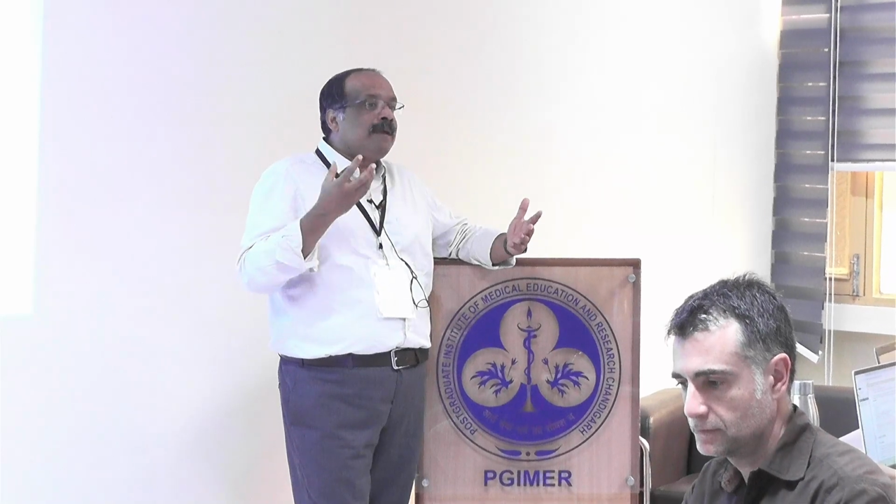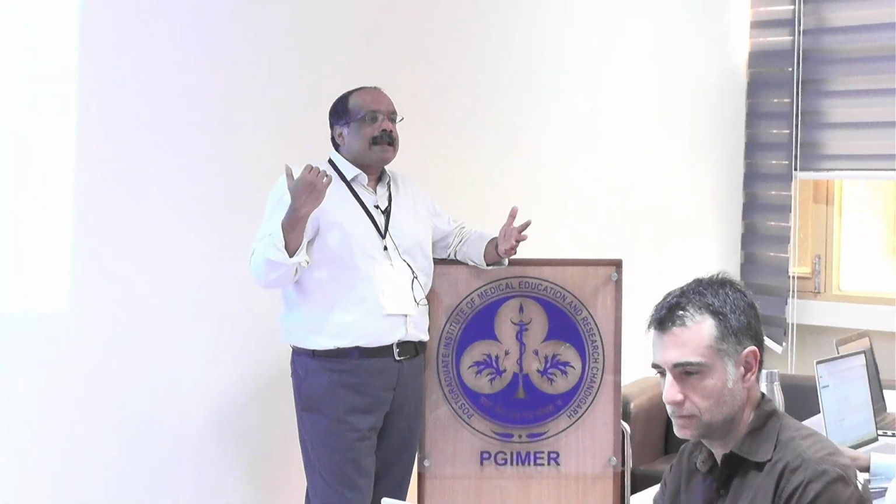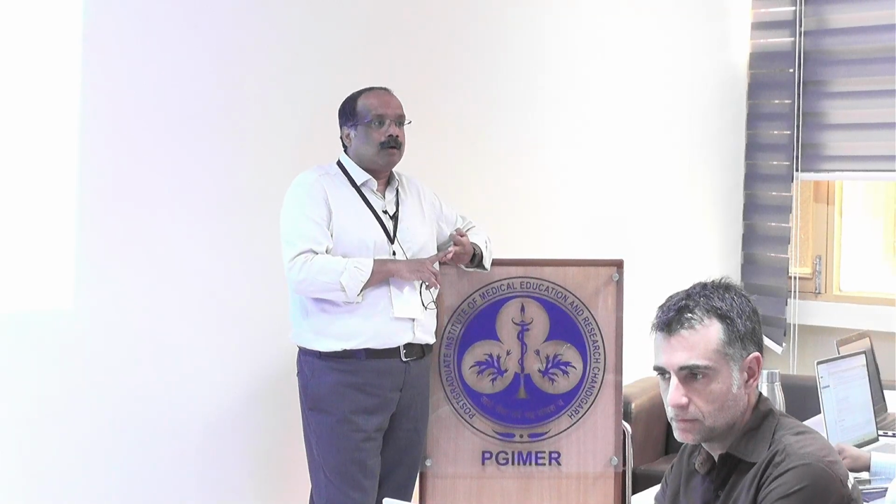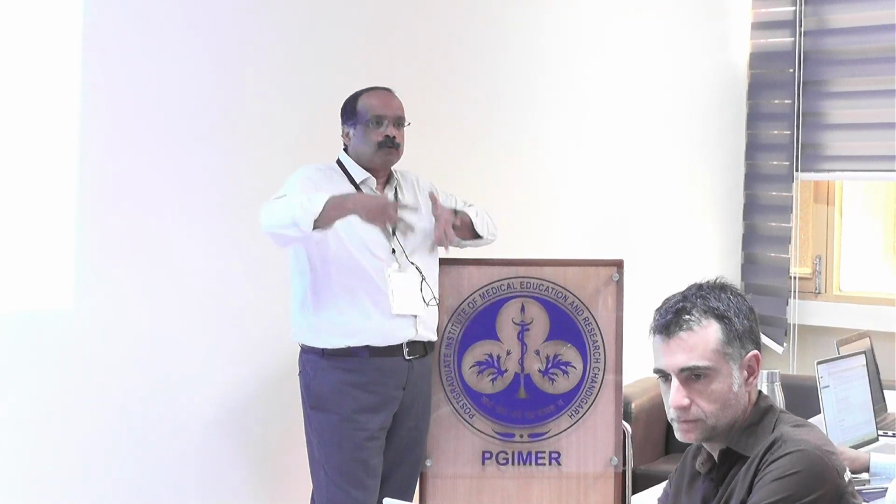So now they are using the flow cell to image cells in the sequencer. The AVITI sequencer from Element that I showed you can do cell morphology analysis, in situ RNA sequencing, and protein analysis on the flow cell. You put your cells on the flow cell itself and it images from there, because these are high speed cameras with a microscope.